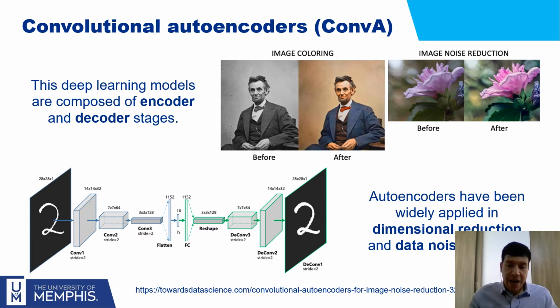There is a medium part of the model in which the information is totally summarized, totally abstracted, and after that part, which will be the decoding part, the information is recovered again to obtain the final dimension, which must be the same as the input dimension of the image.